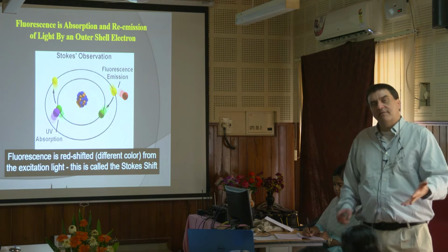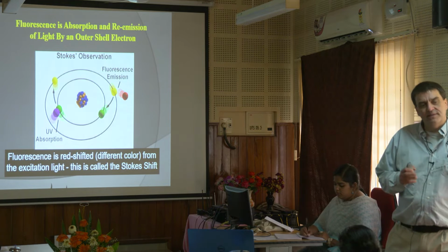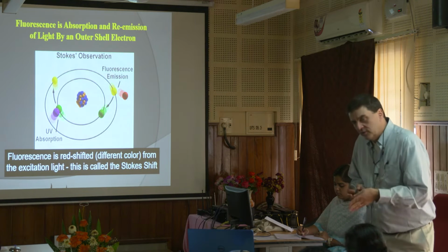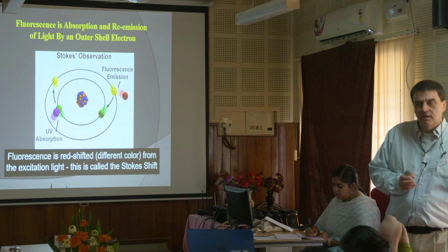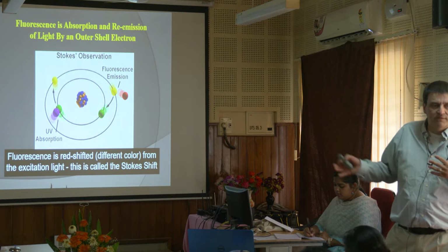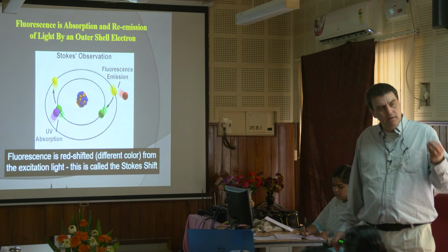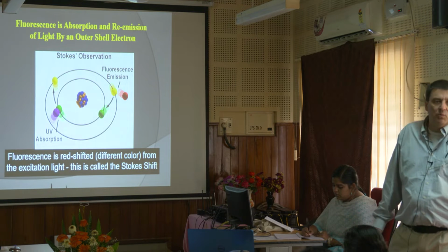But with the advent of lasers and brighter lights and stuff, FITC tends to bleach, okay? So if you can avoid using it, you're better off, okay? Especially with the confocal here, because the confocal will just crush FITC. It will not hold up and last. The dye will bleach and it just won't work anymore.